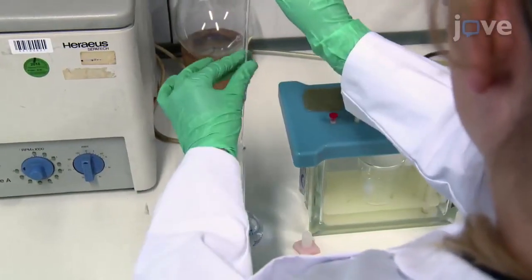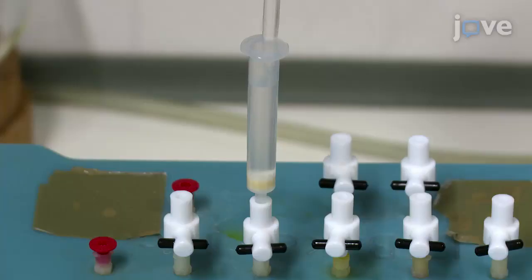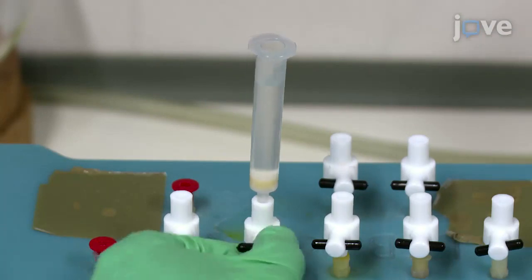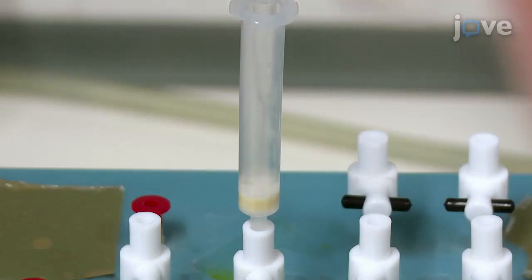Next, add three milliliters of methanol to the solid phase extraction cartridge to begin equilibrating it. Wait for the methanol to leave the cartridge and then add three milliliters of ultra-pure water.